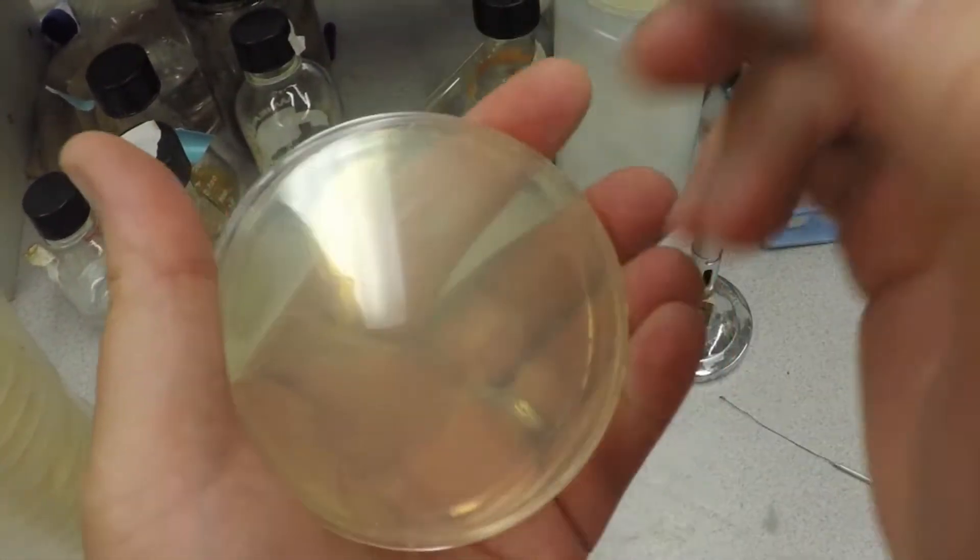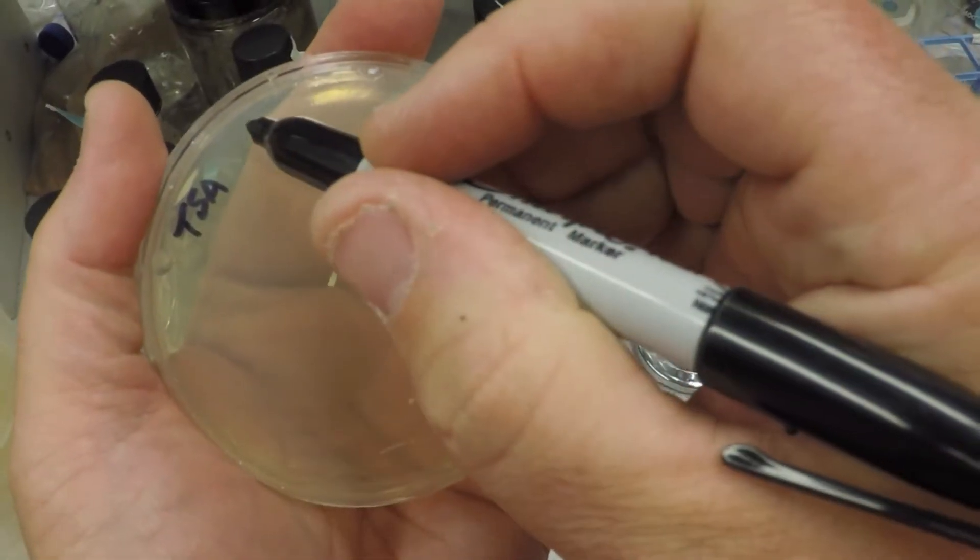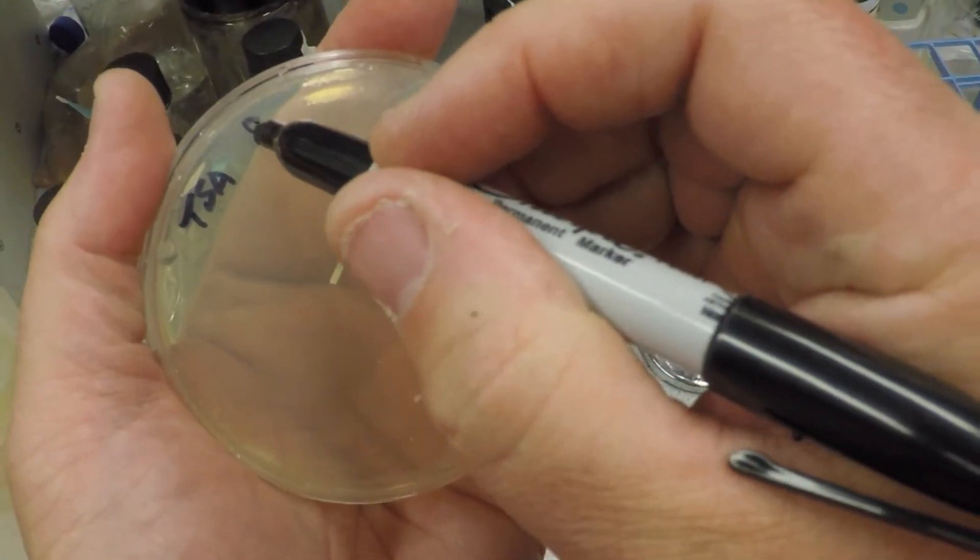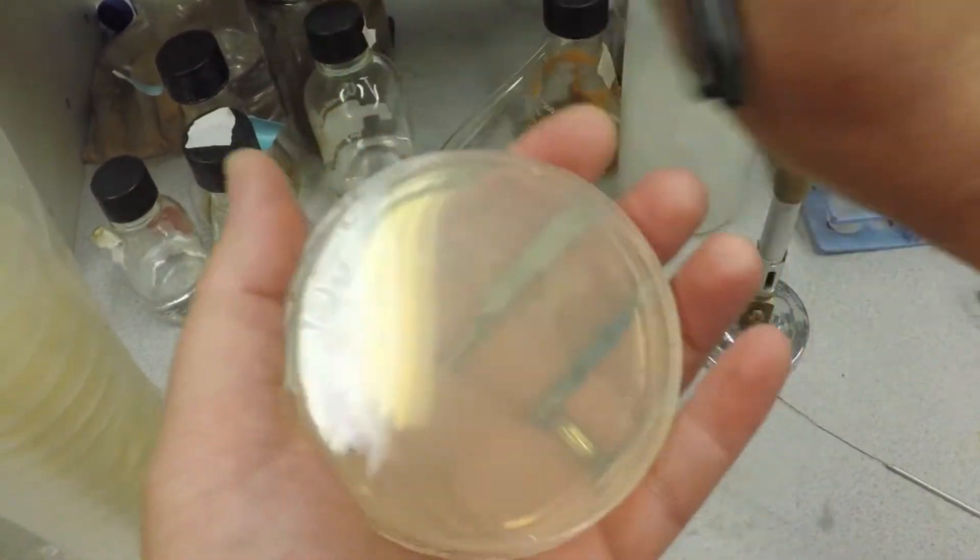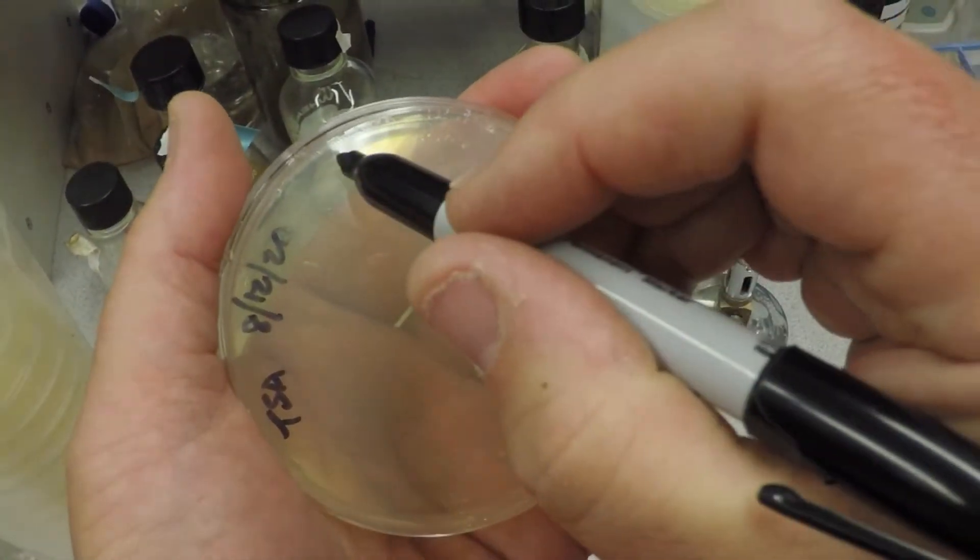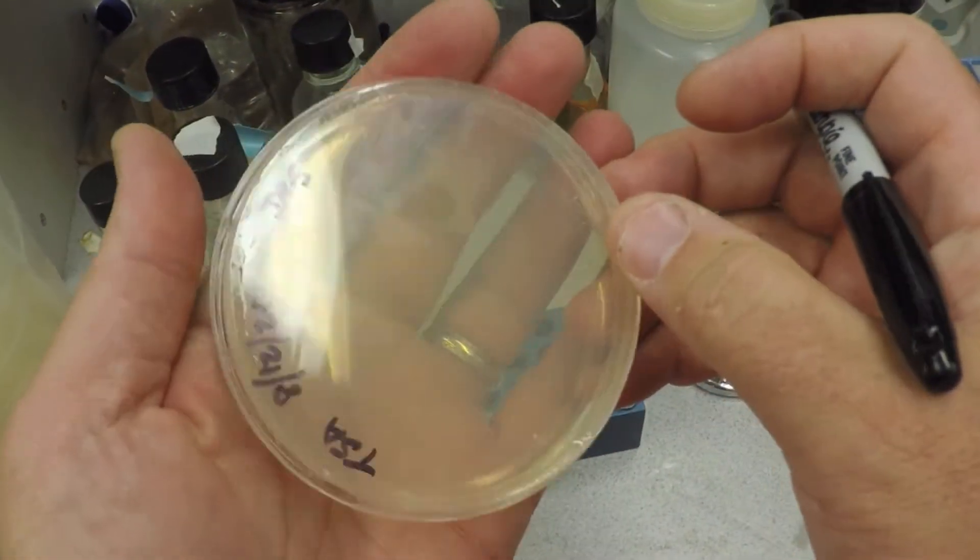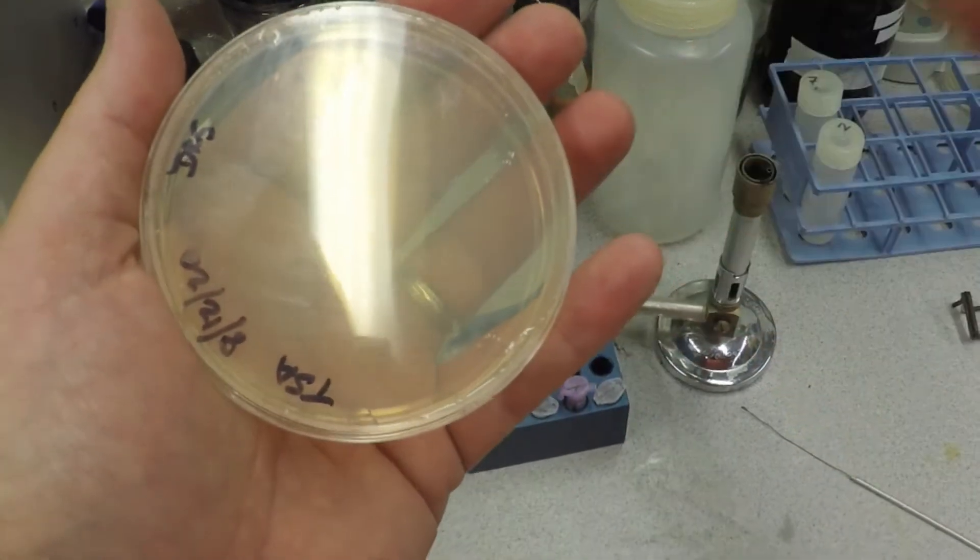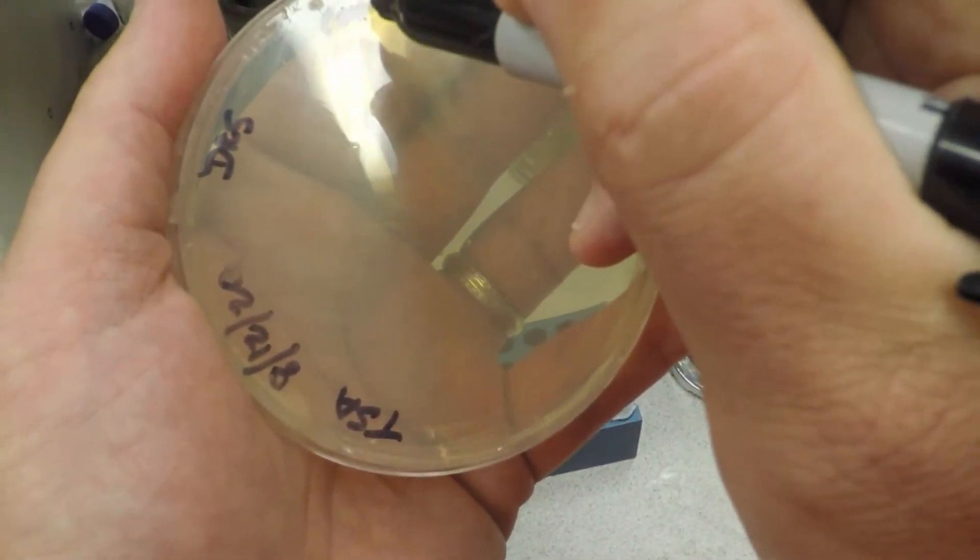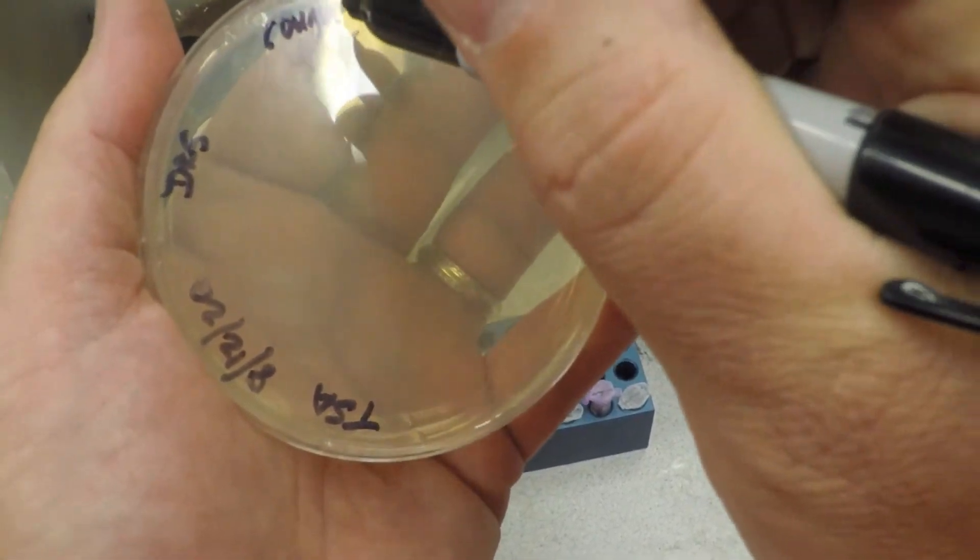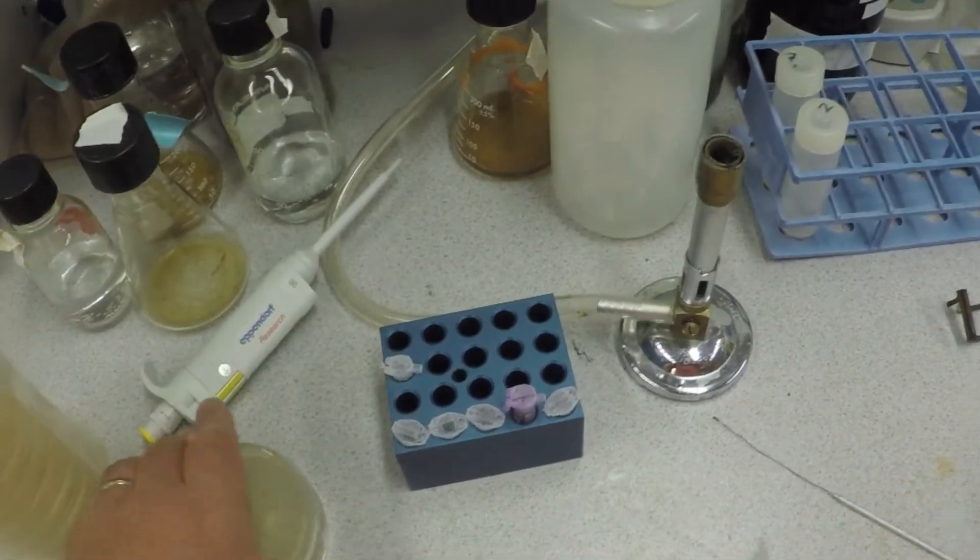When you take a sample, you label it. You always put down the type of media, tryptic soy agar. You put on the date, today is 8/12/20. You put down who's doing it so you can recognize your plate later, so I'm DRS. And then you put down what it is. This is cough minus mask.